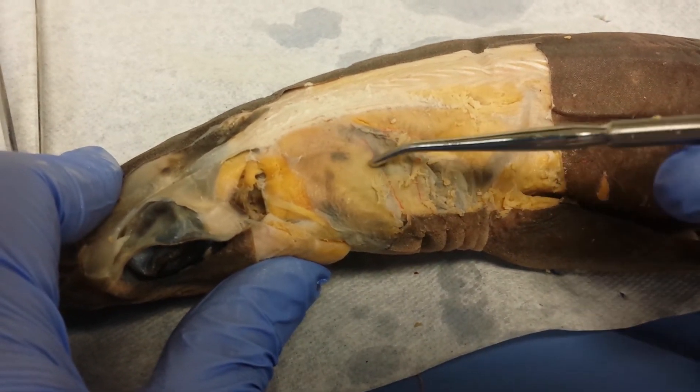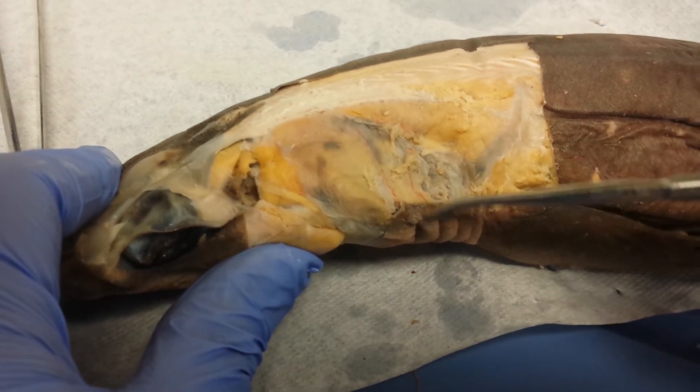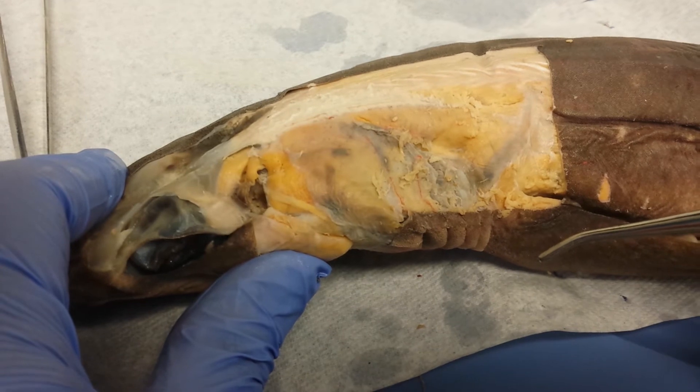Most of the third through sixth, it's butchered in here, but it should be on top of the gill slits. Third through sixth dorsal gill constrictor.